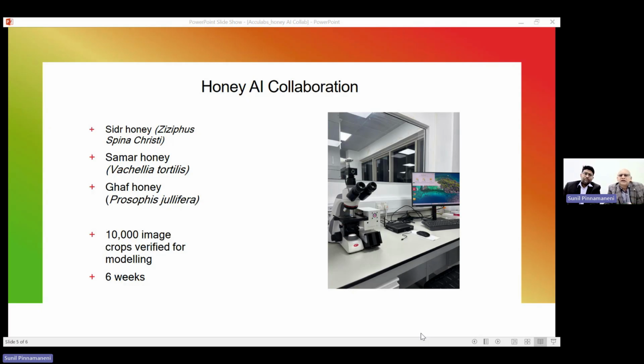Because as a testing commercial laboratory, we need to be very uniform, and we need to take into account all the aspects where we can go for accreditation in the long run. So we wanted to have a well-established method, and we focused mainly on the sampling procedure first, because the preparation makes a good slide, and a good slide gives you good data.